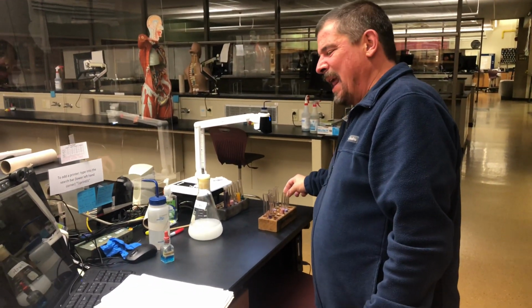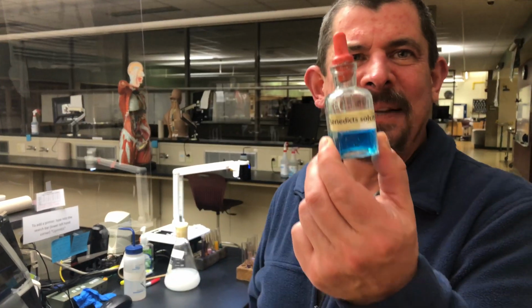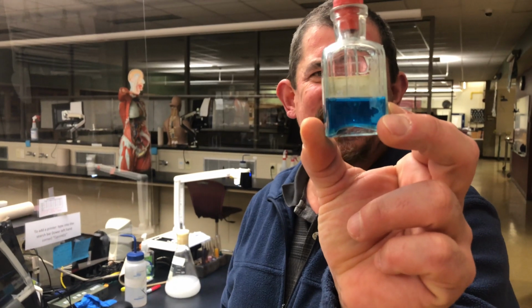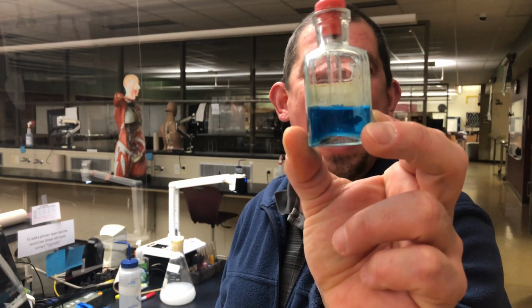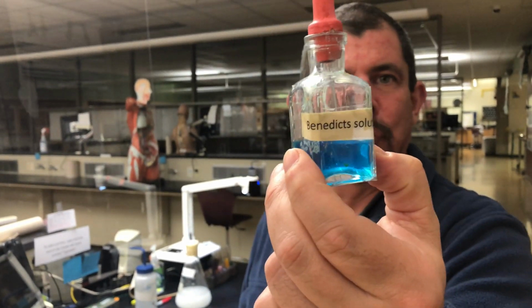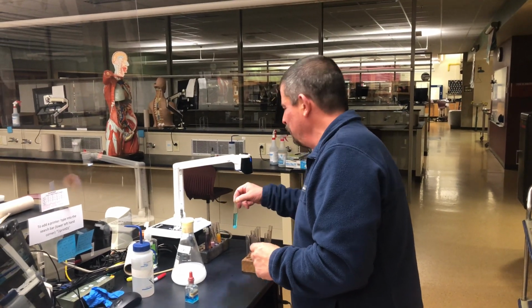Now in both test tubes, we are going to add Benedict solution. And again, you can see the Benedict solution is kind of that teal or aqua blue. We add that into both test tubes, and then we would have 2 test tubes looking like this. But that's still not enough to tell us if carbohydrate digestion has taken place or not.